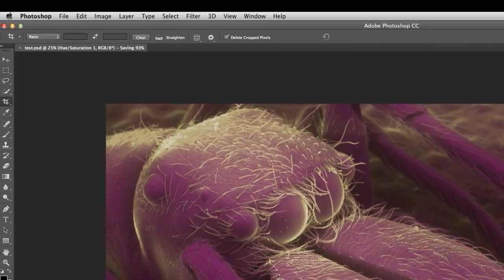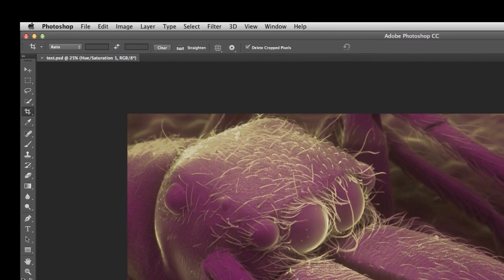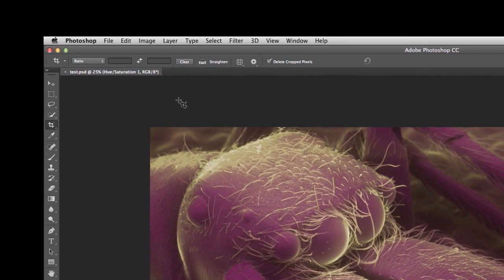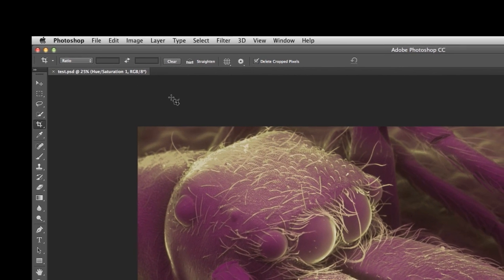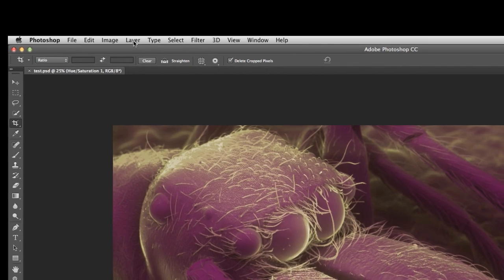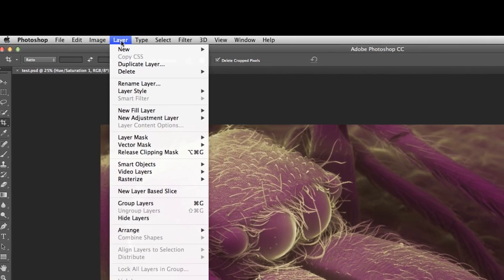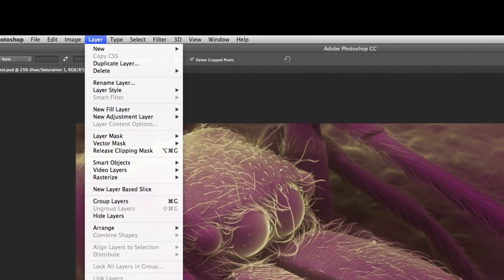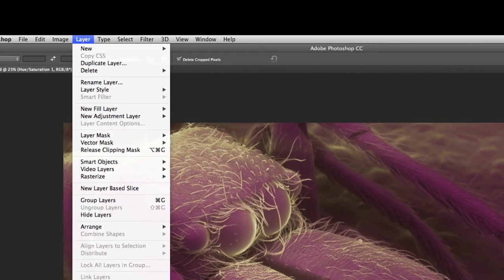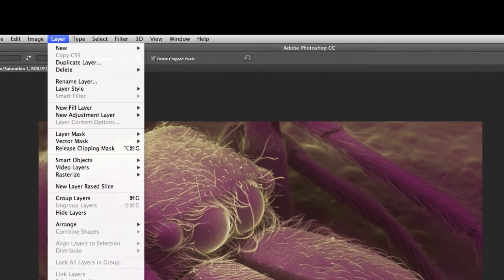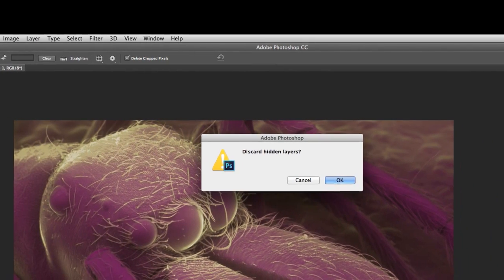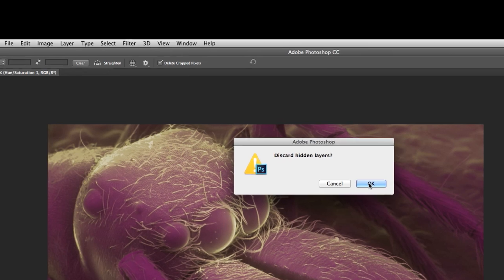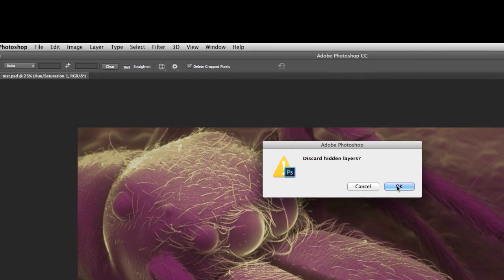If I'm going to show this picture on the web or in books or magazines or something like that, I want to come down here to a layer. And I want to flatten the image. I want to get rid of all these Photoshop layers. So I flatten the image. And I say, OK, it's going to discard any of the hidden layers.